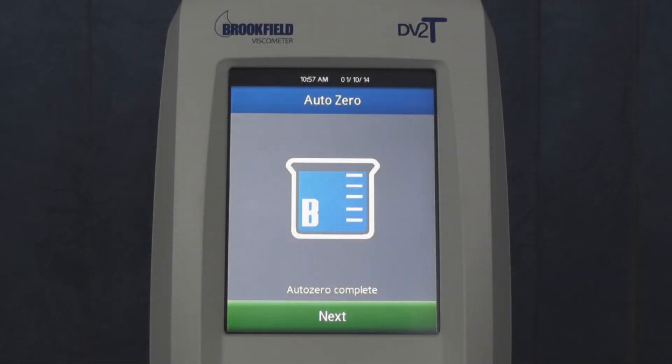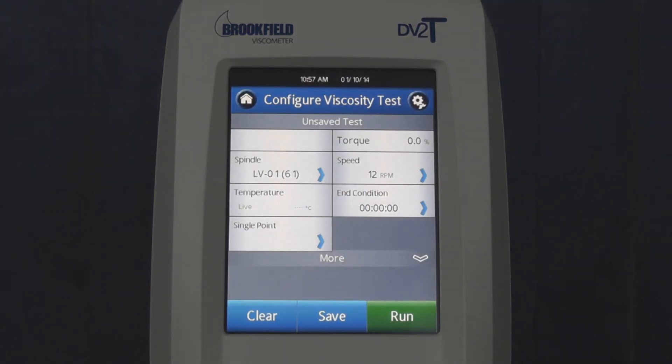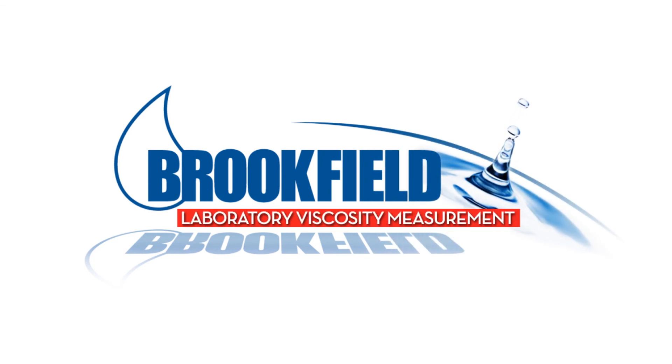After about 10 seconds, the beaker will stop pouring and an AutoZero complete message will be displayed. You will be prompted to press another Next button, which will conclude the AutoZero procedure and bring you to the Configure Viscosity Test screen.